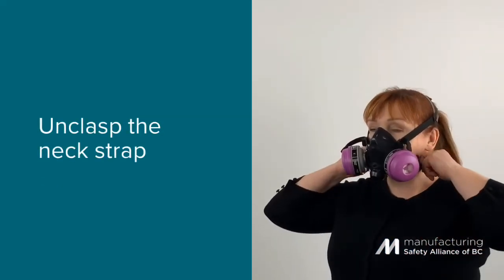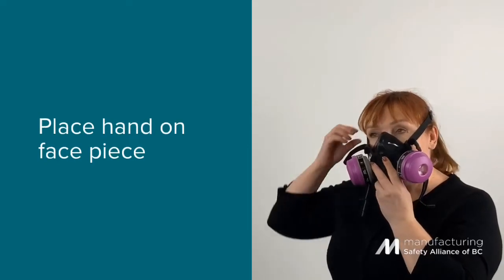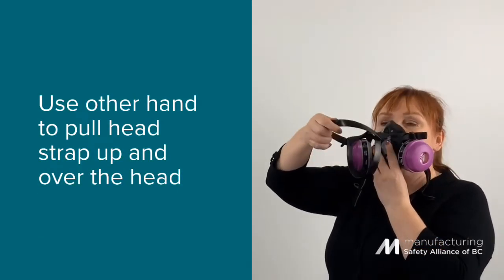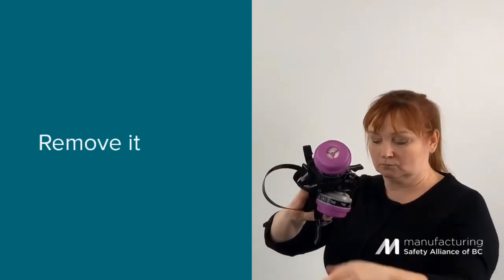Reach over to your neck strap and unfasten the clasp. Next, place one hand on the face piece of your respirator. Take your other hand and grab onto the head strap and pull it forward over your head. Remove your mask completely.